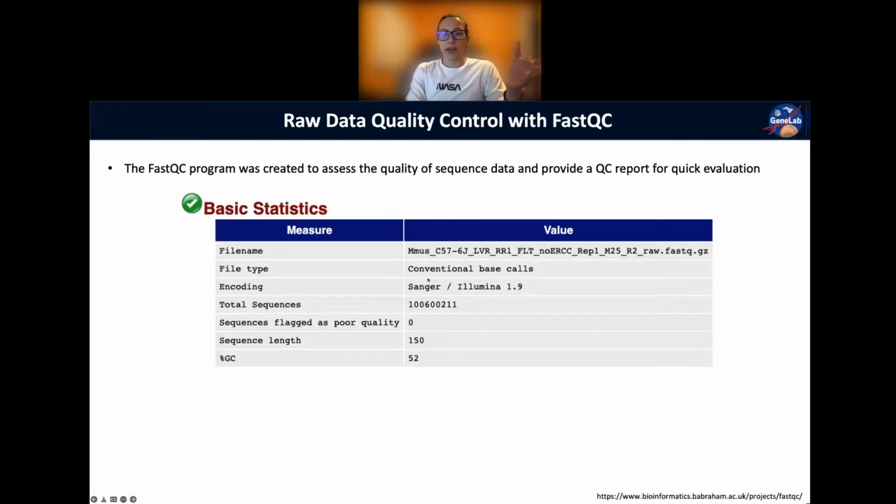So the quality of the Phred 33 scores, those are actually the same scores, using the same algorithm, that are used in Sanger to identify scores. So that's why you see Sanger and Illumina. And then total sequences. So I'm just going to prod you guys for this.